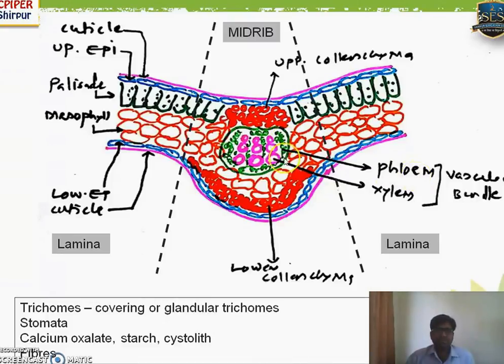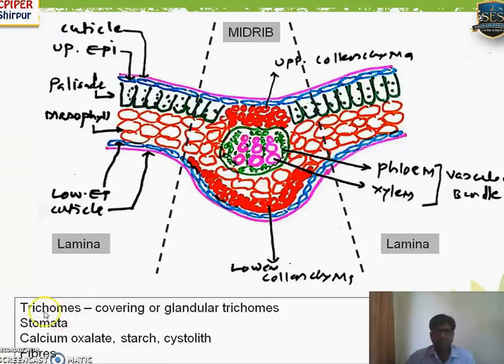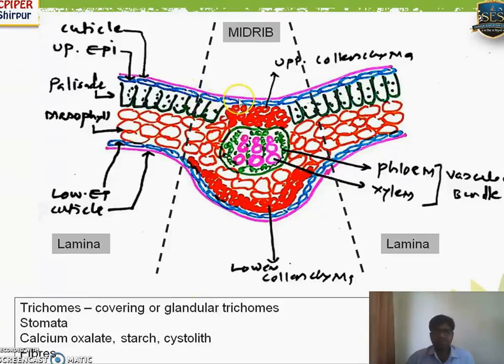Vascular bundles consist of xylem vessels, which are dead and lignified and responsible for carrying water from root to leaf, and phloem, which is responsible for conduction of food — it is non-lignified and cellulosic. In the leaf, phloem shows only sieve tubes, while xylem tissue shows only xylem vessels. The differences between different leaves lie in trichomes — extensions or outgrowths of the epidermis. There may be covering trichomes or glandular trichomes, each with different types.